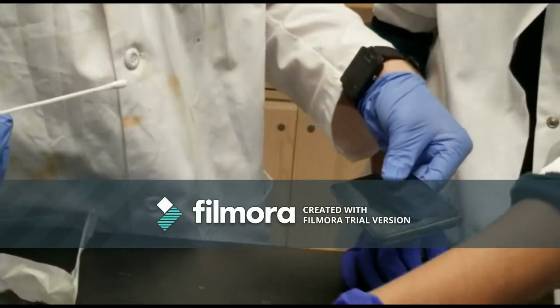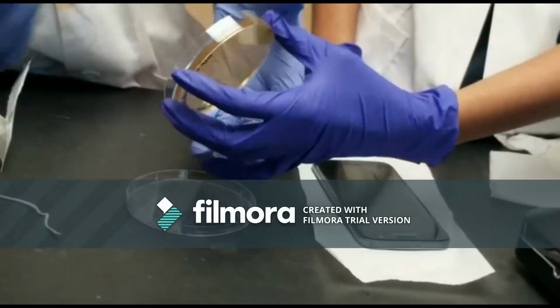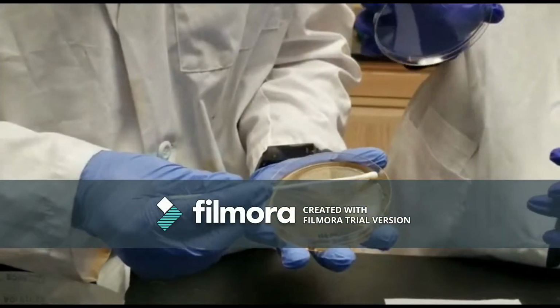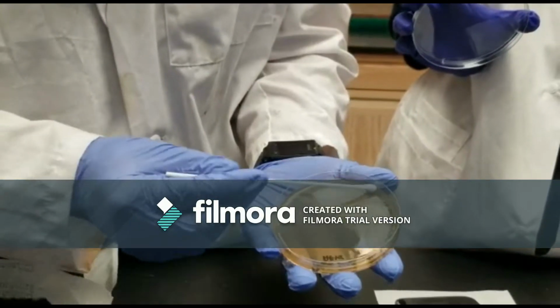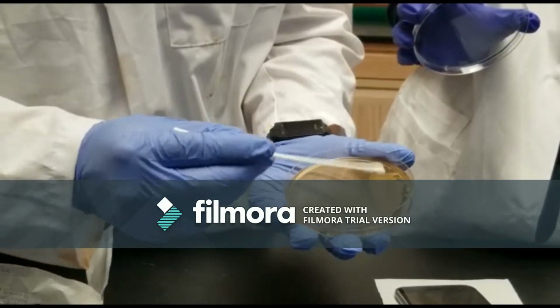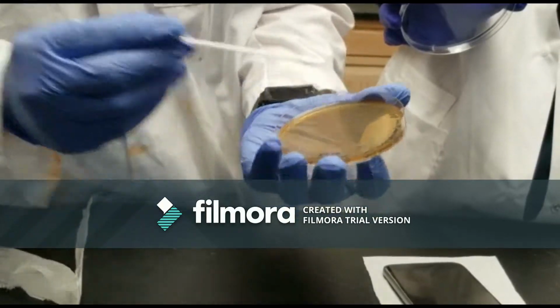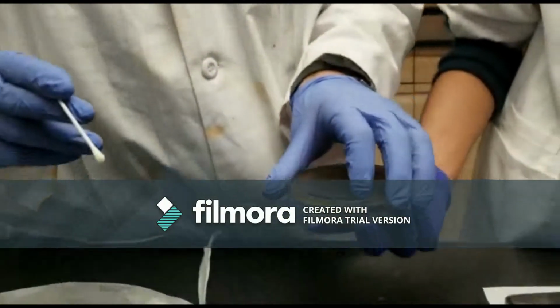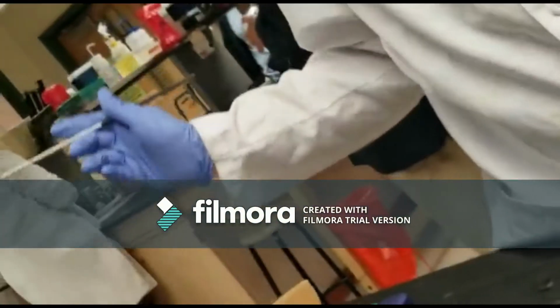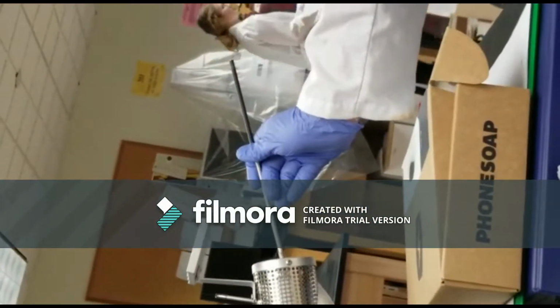A second nutrient agar plate was obtained, and the quadrant streaking method was utilized, the first quadrant being streaked by the swab. As done earlier in the experiment, an inoculating loop was used to complete the streaking on the nutrient agar plate.